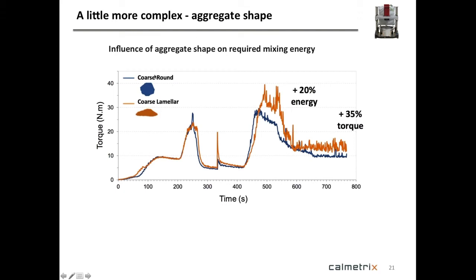And so we would be able to look at the same mixture with overall aggregates that are very comparable, but on one side you would have those that are a little more spherical, as you see in the blue one here, and then you had the other ones that are of more lamellar shape, which are the orange ones.